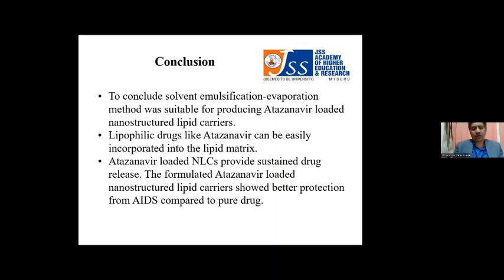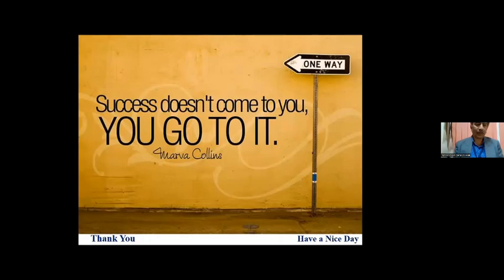To conclude, the take-home message: the solvent evaporation method was found to be suitable for producing atazanavir loaded nanostructured lipid carriers. Especially lipophilic drugs like atazanavir can be easily incorporated into the lipid matrix. This lipid matrix system provides sustained release of the drug for a period of 24 hours, and this can be useful for the treatment of AIDS as compared to the pure drug. Thank you for your patient hearing.